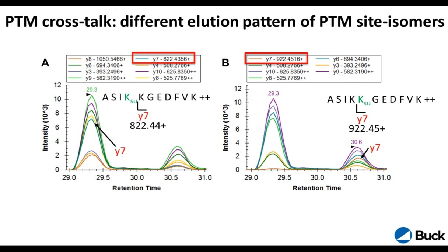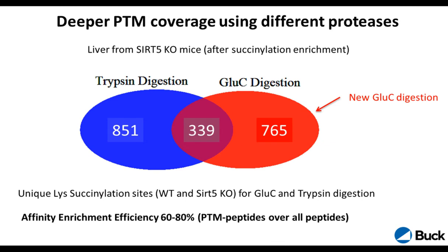So we would have even been able to differentiate these isoforms if they had co-eluted. So this is really a power of combining very well done affinity enrichment tools and workflows with modern scan types and really getting the most information out of a PTM space as possible. And I mentioned earlier to you, you could actually increase your coverage in depth even further by using different proteases.